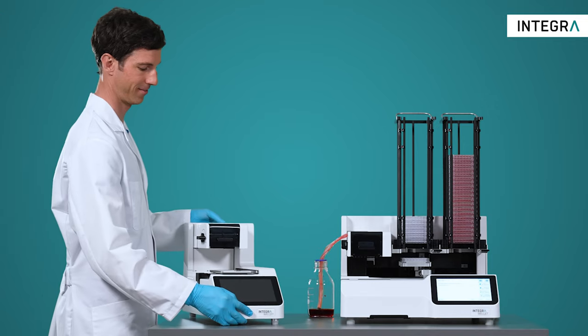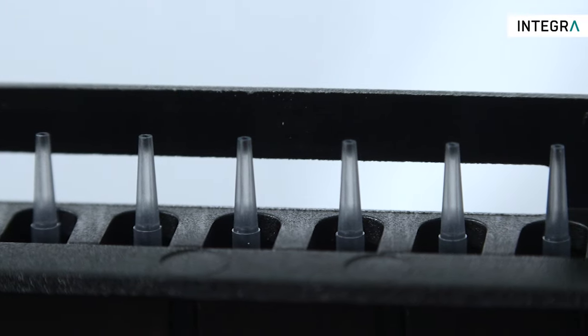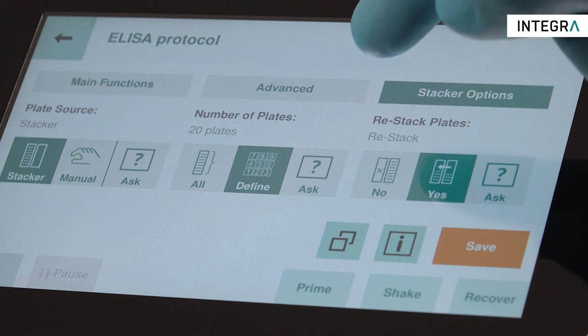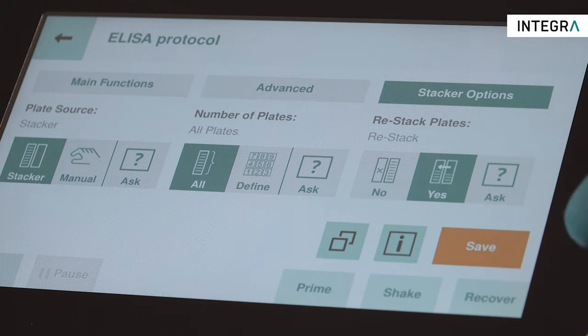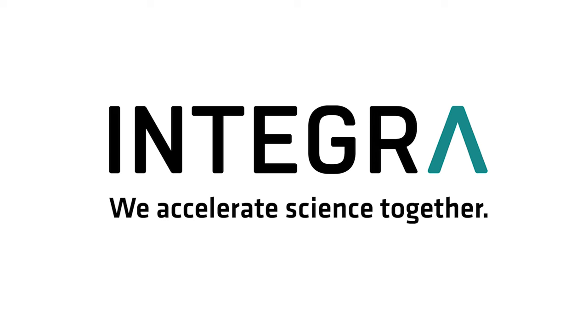Take your reagent dispensing applications to the next level and benefit from compact and affordable instruments, low instrument running costs, easy handling, and superior user interaction with the new and revolutionary WellJet Dispenser and Dispenser Stacker. For more information, visit our website.